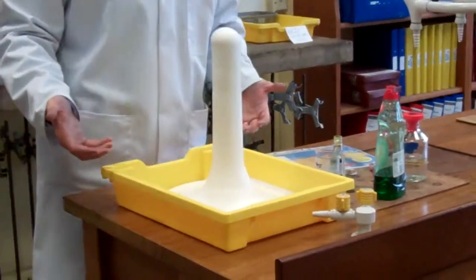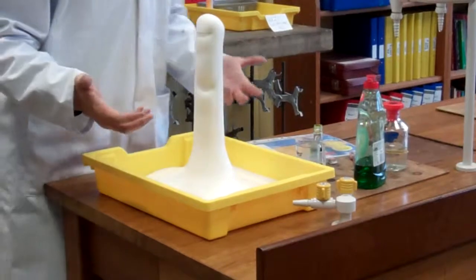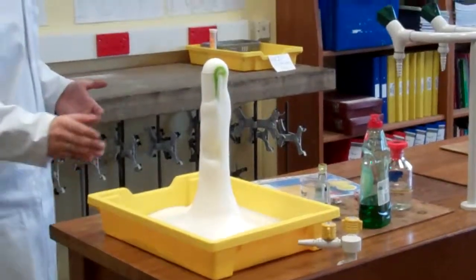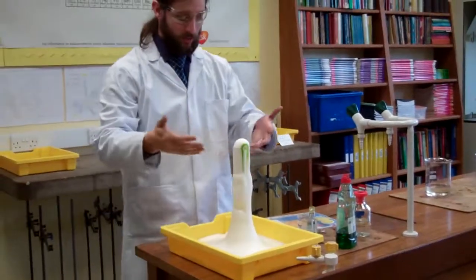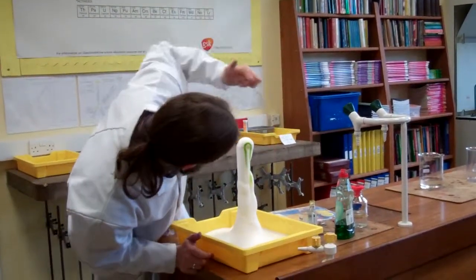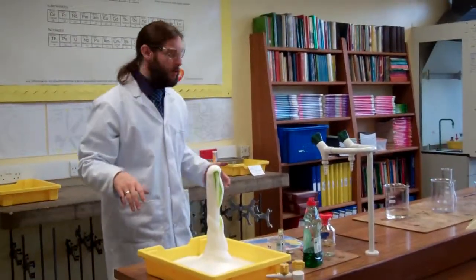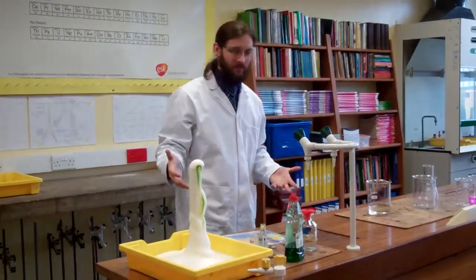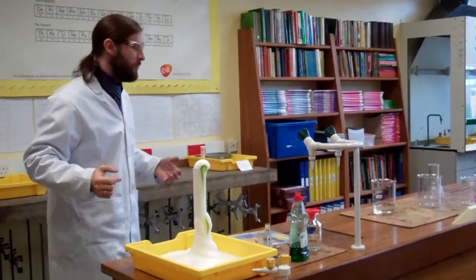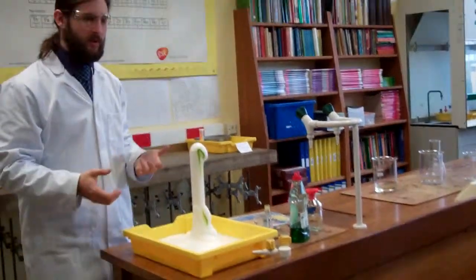There we go. So this is the elephant's toothpaste. It's not worked with the stripes as I wanted, but what we can see is we've got that rapid decomposition. We've got lots of gas that's being trapped in my washing up liquid, and it'll just keep frothing. It's slowly filling up my tray. We've got this nice frothy effect. If you do this under the right conditions with really fresh chemicals, you can actually sometimes get it shooting right out the top. We've got a nice green stripe — that's what I was aiming for. But yes, this is just playing with gases. There's no real flames, no real pop.